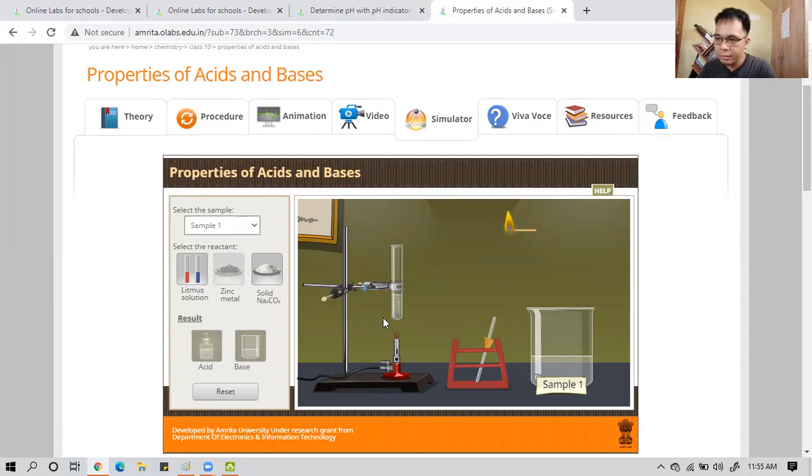So, if you notice, we are generating a gas. It evolves, it generates gas. So, what is that gas? That is hydrogen. So, what you will do next is cover it using this cork with a capillary glass tubing here that has a hole. And then, turn on the Bunsen burner.